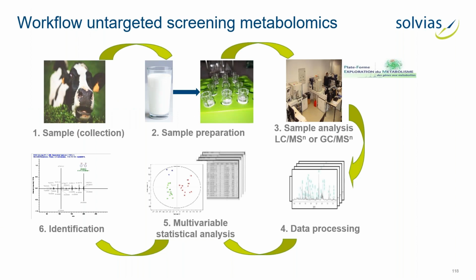The study I was doing had a cow as our sample. It's not because we're in Switzerland, it's because it was the subject of our study. We take samples from milk, blood, urine, and rumen fluid, and we have to put these into an HPLC vial so that we can analyze them with GC-MS and LC-MS technologies. This is a common, very well established workflow.